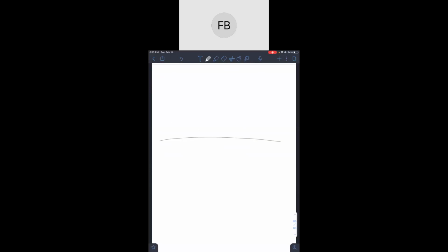For the next one, he again has something around 7. We can't really see what it is, but if we looked at it, it would actually only have four in it. So this would be a Q. It has 4 in it, and that tells us that our aromatic ring only has 4 hydrogens in it. So those hydrogens like that, right?